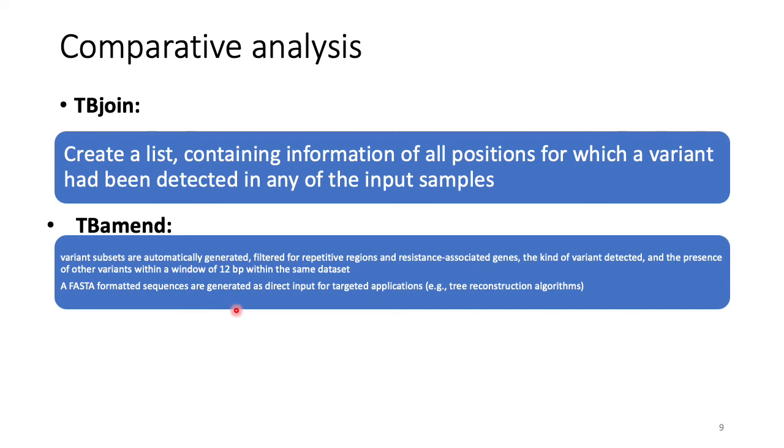These FASTA files can be the input for the phylogenetic analysis, for example, using RAxML, or for the minimum spanning trees that you want to calculate.